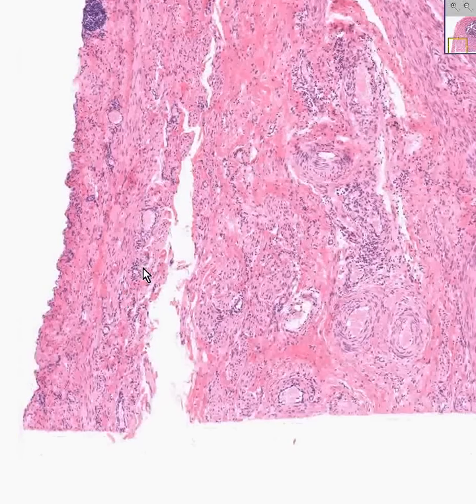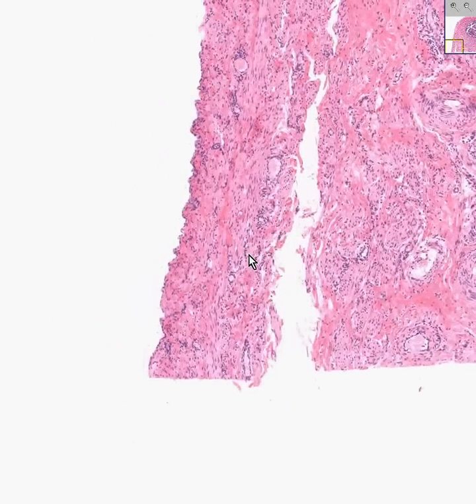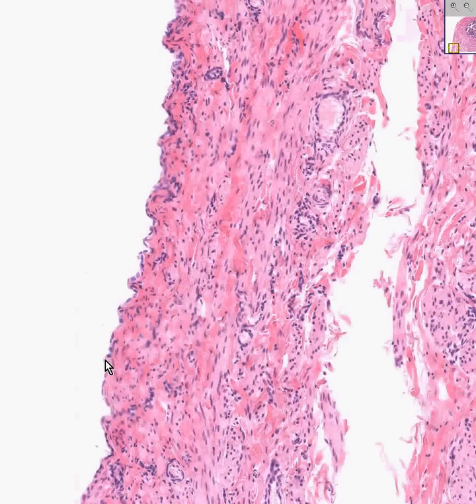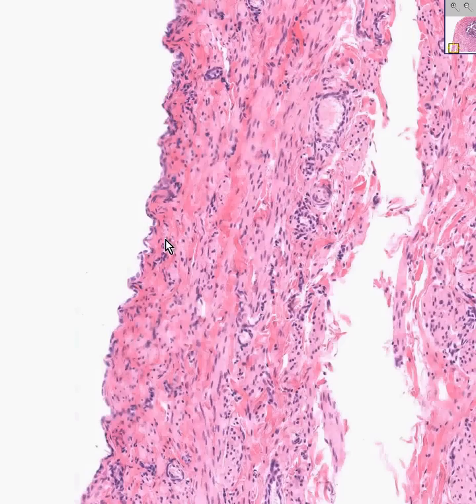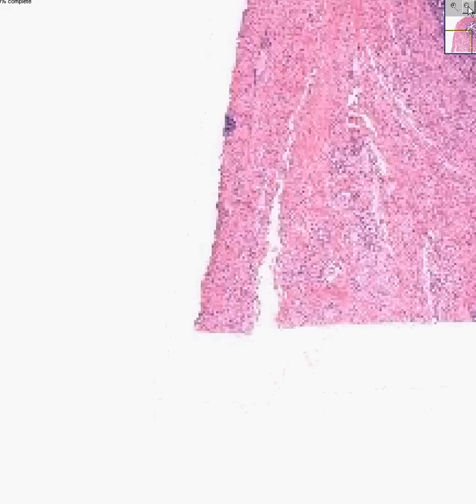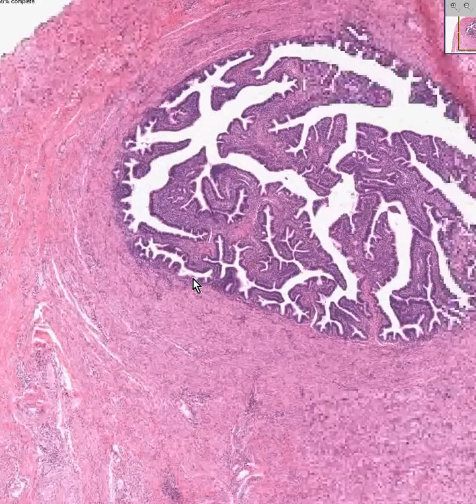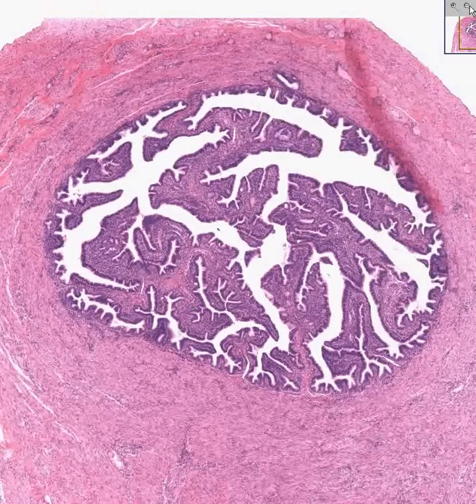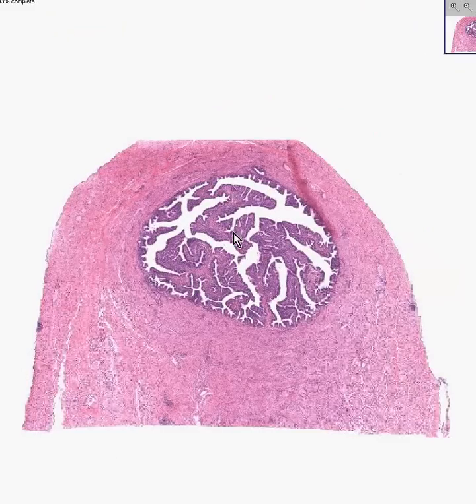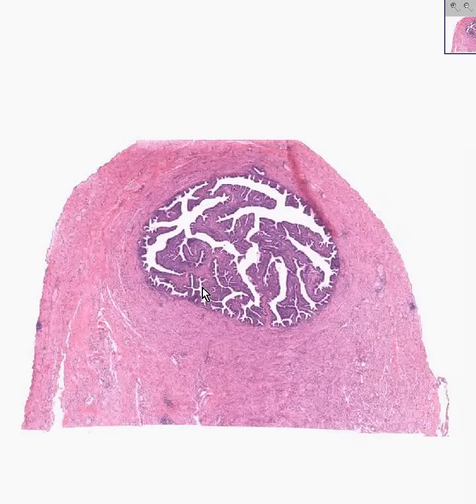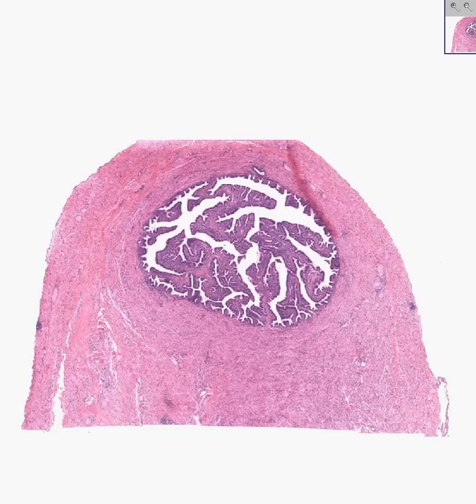Last but not least, because the fallopian tubes are truly intraperitoneal, there is a fine little layer of mesothelial cells representing visceral peritoneum surrounding the complete outside of it. There's nothing more that I could say about a fallopian tube that wouldn't be wasting your time, so let's take a quick mental snapshot of the world's nicest ampullary portion of the fallopian tube and move on.